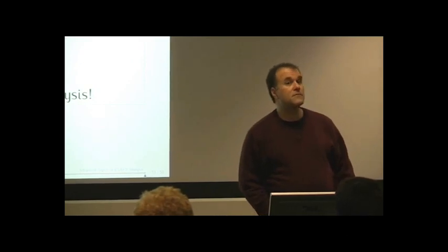Yes? When you do actually the fits with a lot of parameters, how sure can you be that the program is not going to get stuck in some local minimum rather than the global minimum of the function? Really, how robust is this fitting procedure? Not very, I guess. It's just Levenberg-Marquardt minimization. So it does happen on occasion that if you try a different starting value for some parameter, you end up in a very different place. You see that on occasion.